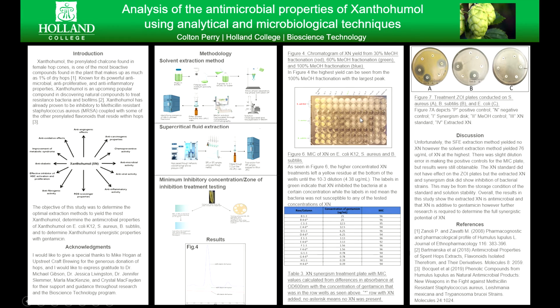The MIC conducted can be seen in figure 6 right here on the poster. E. coli K12 did not have any inhibition from xanthohumol. However, S. aureus and B. subtilis both had inhibition from the xanthohumol dilution series, as we can see here in figure 6.